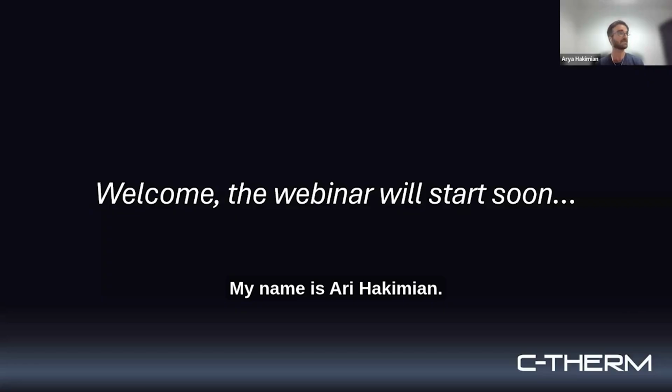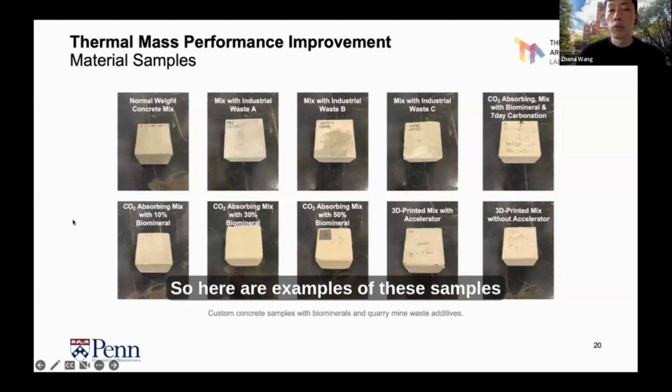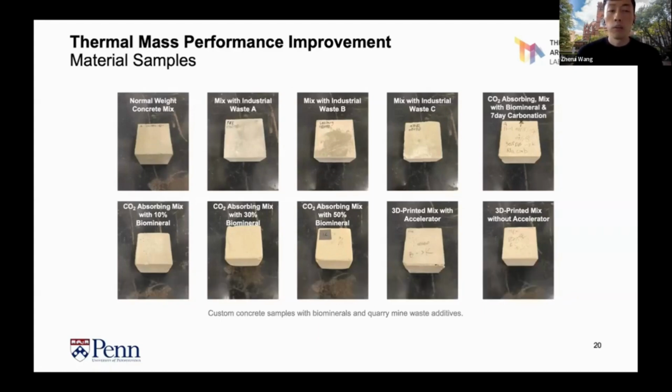My name is Arya Hakimian, and today we are taking a look at the thermal conductivity testing for building thermal mass performance in cement. So here are examples of these samples that we devised specifically to tailor towards the thermal conductivity and diffusivity testing with the C-Therm machines here.